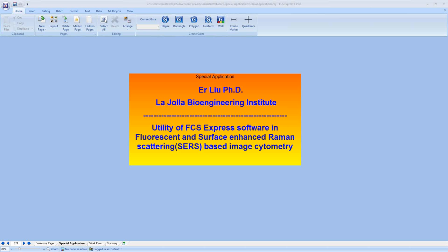The main principles of flow cytometry and image cytometry overlap, such as taking multi-channel fluorescence data and plotting that data in scatter plots and histograms to look for statistically significant differences and changes. What we can now do is take your image cytometry data a step further by leveraging the most powerful analytical tools in FCS Express for flow cytometry to analyze your multi-parametric image cytometry results.